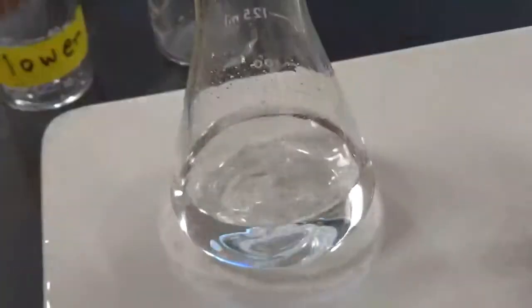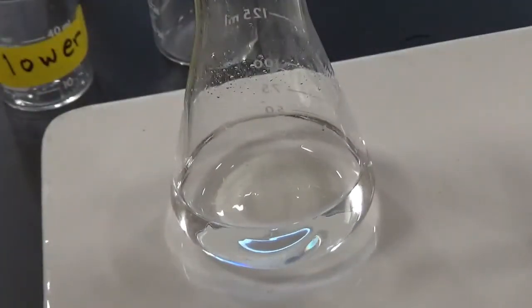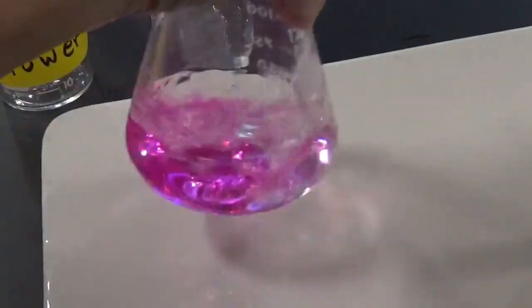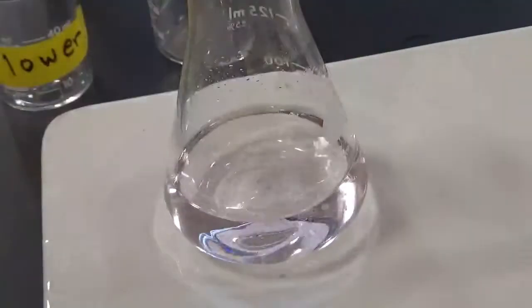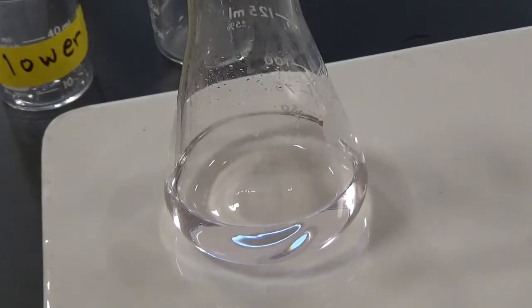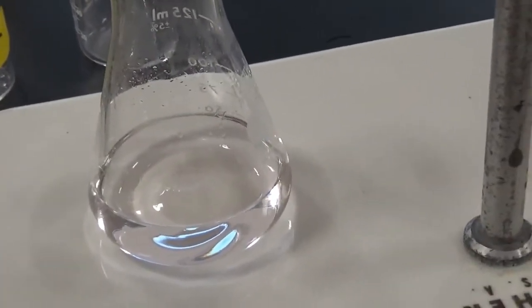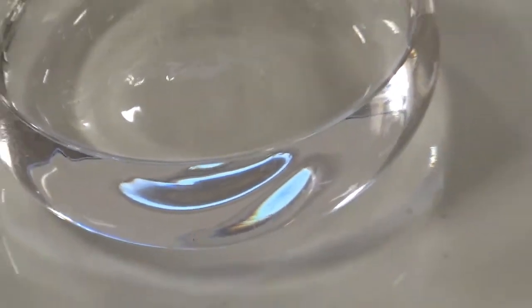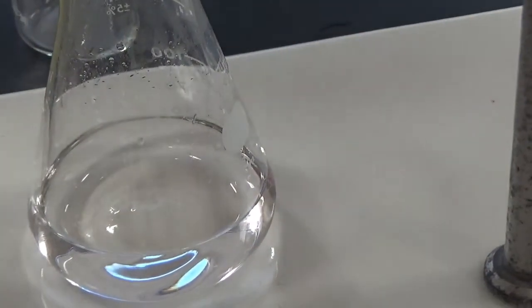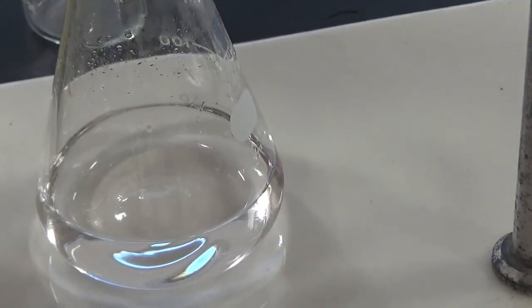Ooh, that was really close. I think I am done. That is a very faint pink. Not sure you could see it on the camera. Maybe I'll put another half a drop just to let you see it. Watch now, 3 drops will go in.